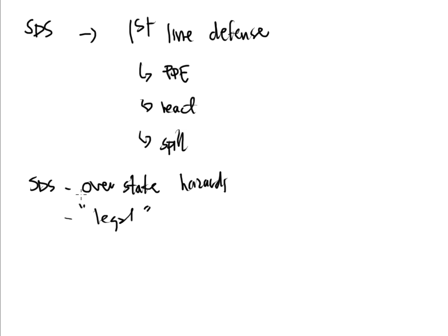What a lot of people forget to realize, though, is that statements made in the SDS document are not really meant for you. Now, I know that you are working with those chemicals in a laboratory and you're probably using very small scale amounts of the chemical. But the SDS, when it was written and formulated, was really intended for large industry.